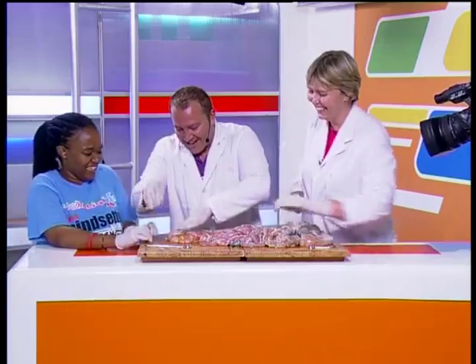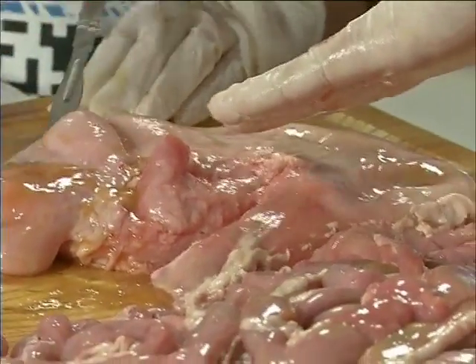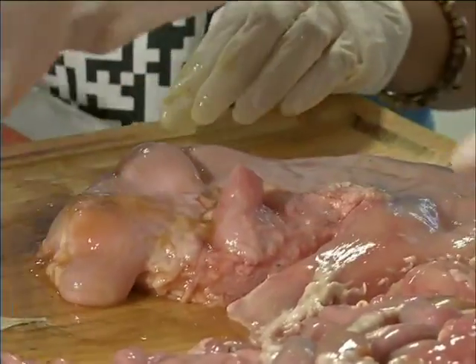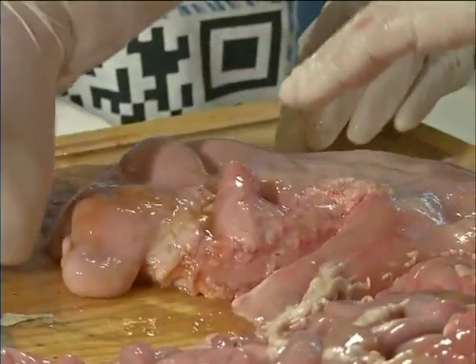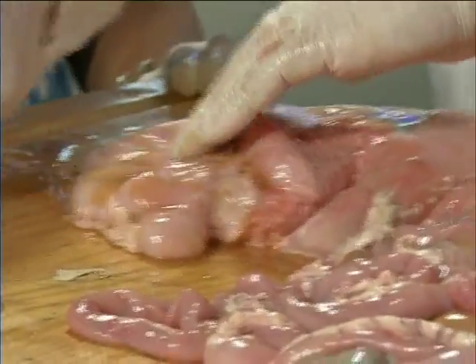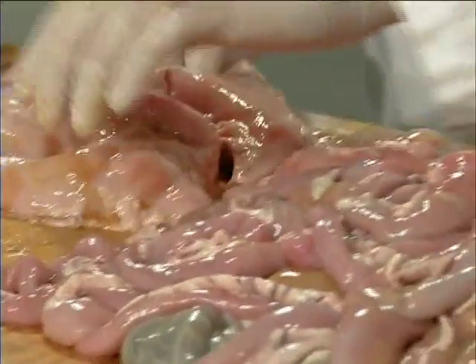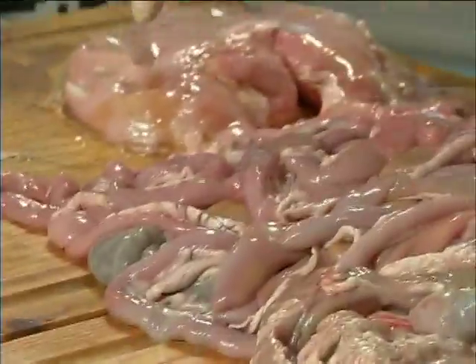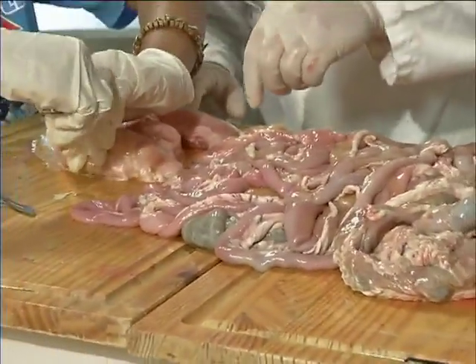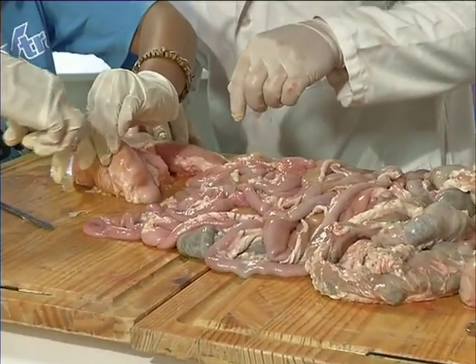What I want you to do is cut it down like that for me. It would be easier. Let me do this first. Everything's going to go everywhere. Then take a pair of scissors, and cut this way and that way, all the way. Use a bucket to catch it, because all the stuff is going to come out and run down onto the floor.